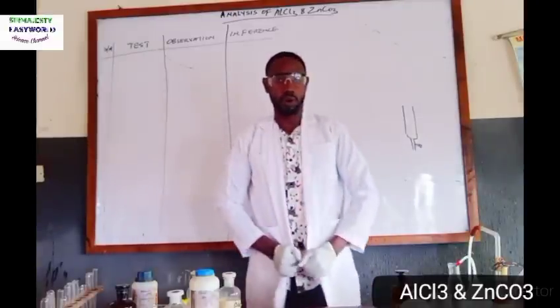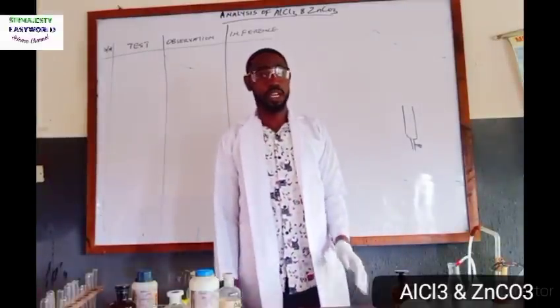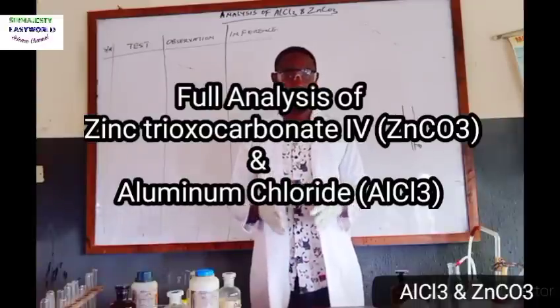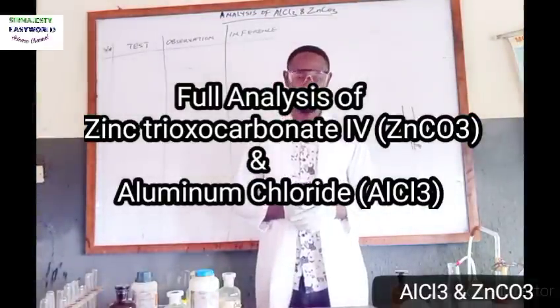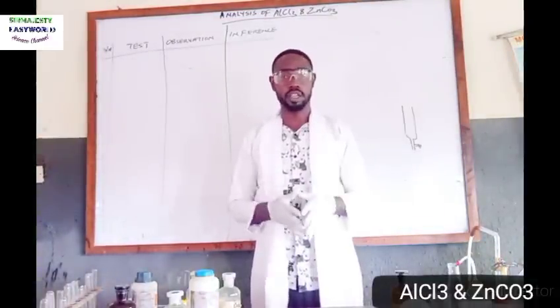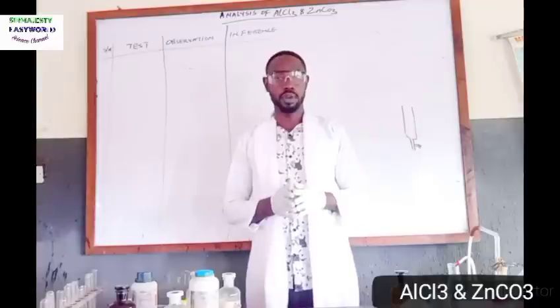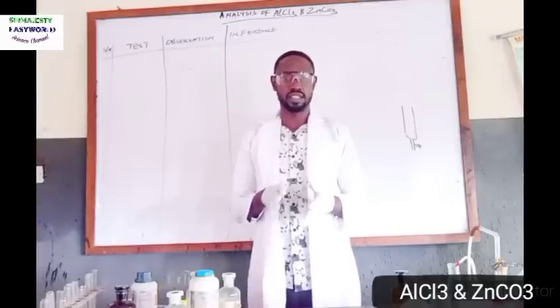Welcome to Sir Majesty Easy World Science Channel. Nice to see a great fellow like you. Today I'll be analyzing two salts all together, and these salts are zinc carbonate and aluminium chloride. So there will be a guide question, likely question. I might give you two or three guides, but remember to understand the science behind each analysis here.